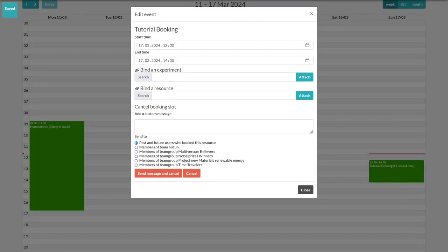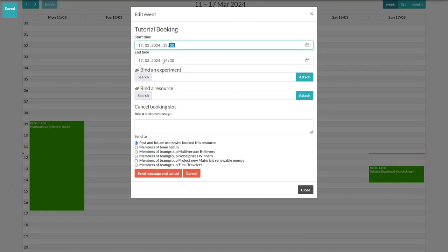After clicking on it, this window opens. Here, you can also adjust the start and end times again.